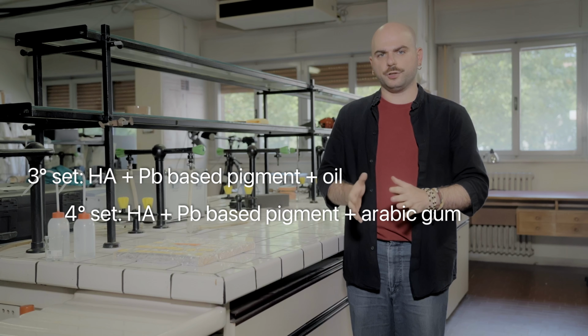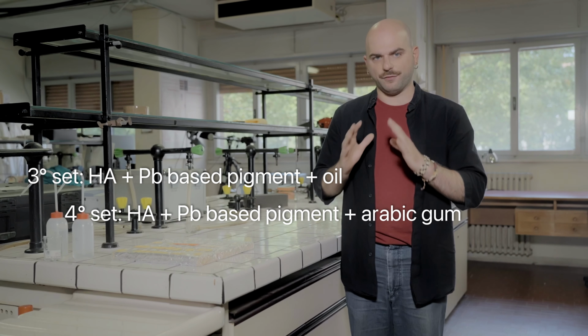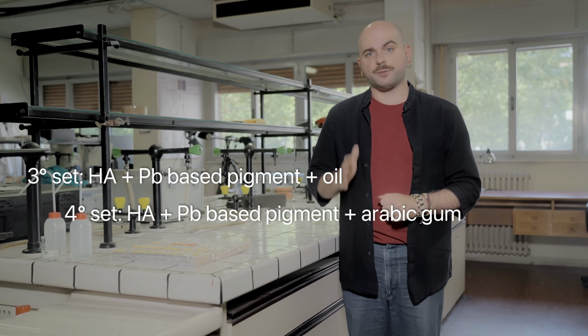With the two other sets, I did something different. I put in the same environment hydroxyapatite, which is a common material used in art. It is present in different pigments, such as bone black, and I mixed it with lead-based pigment. This is because I wanted to see if these two materials put closer in an environment that is not aqueous can still produce any lead calcium phosphate compounds.